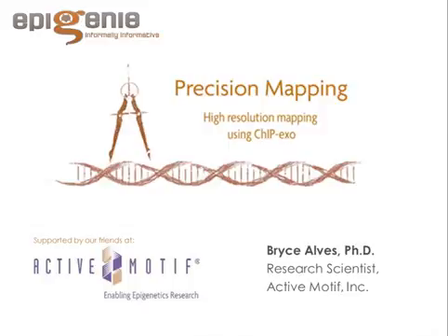When we were developing the adapters, that was the problem we kept running into: if the adapters weren't designed correctly or didn't ligate well, we just didn't get any product to be sequenced downstream, and we got results that couldn't really be interpreted. Right, so that would be a good tip for new users. Make sure that's dialed in.